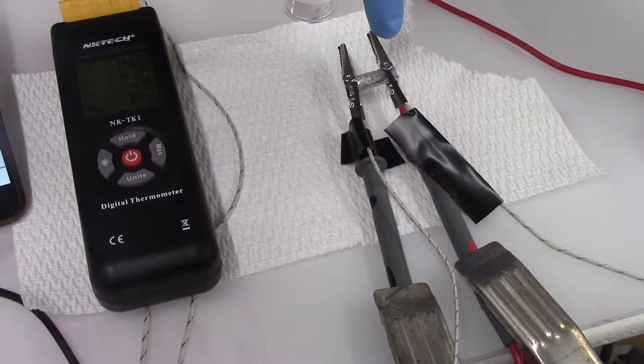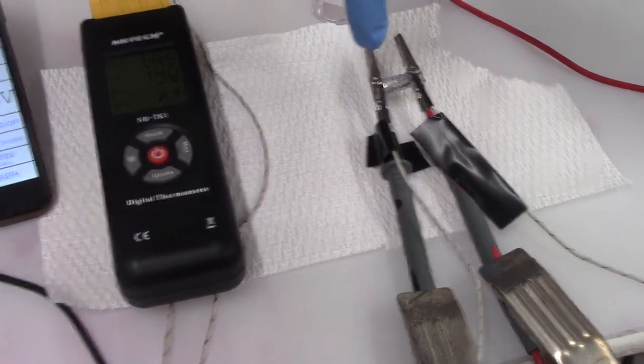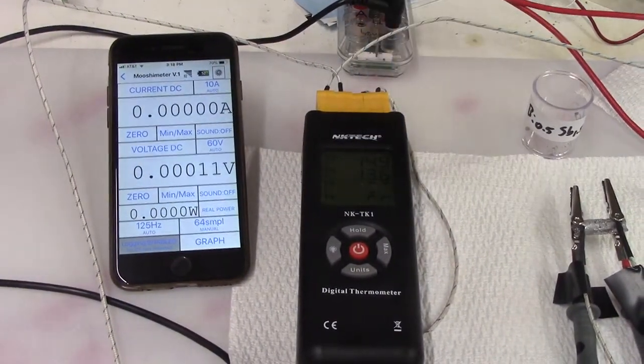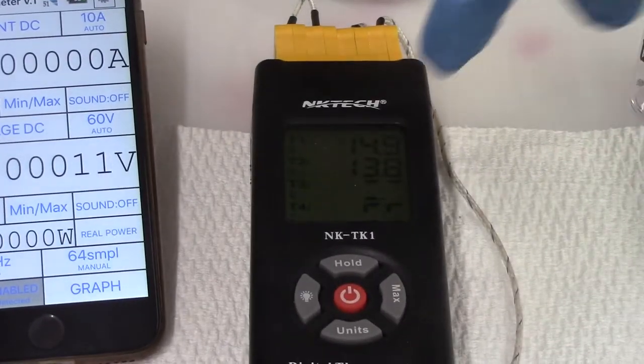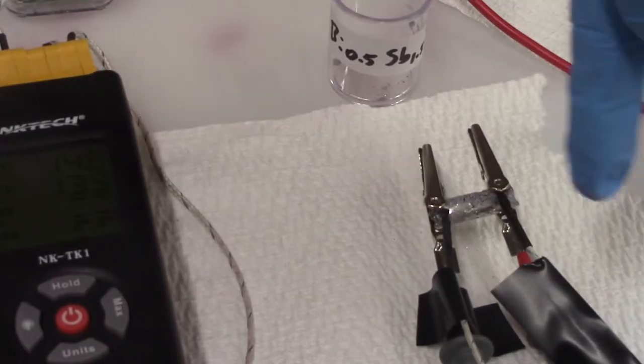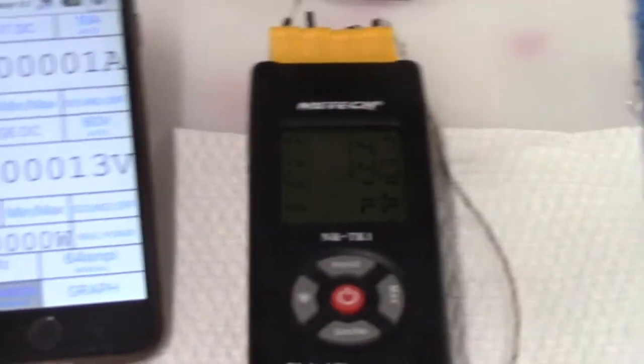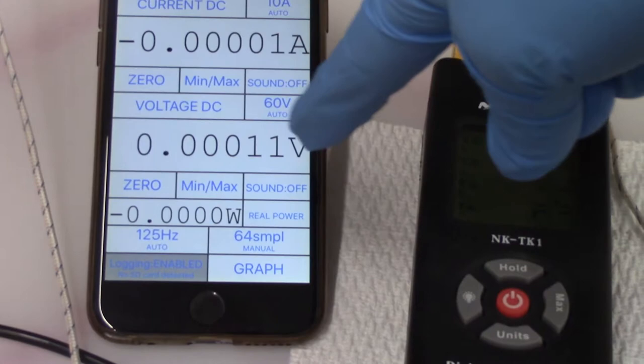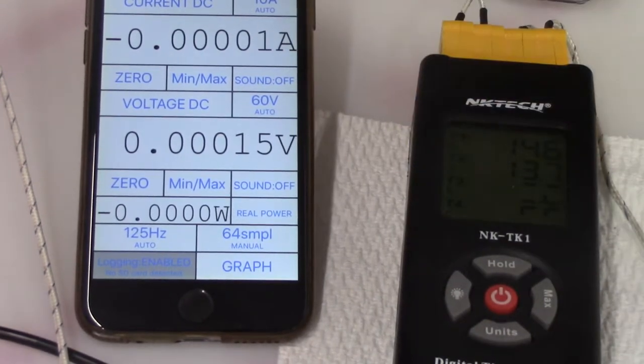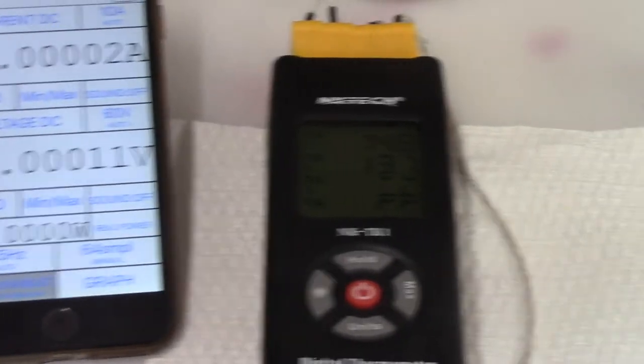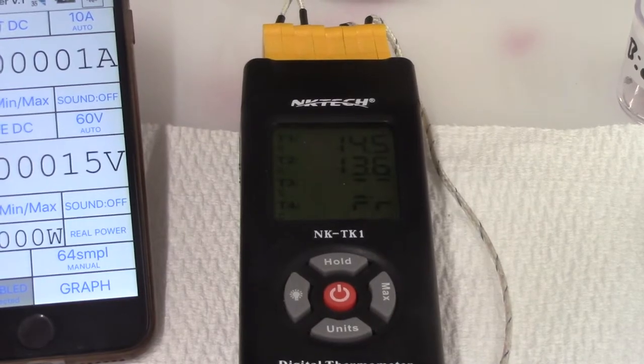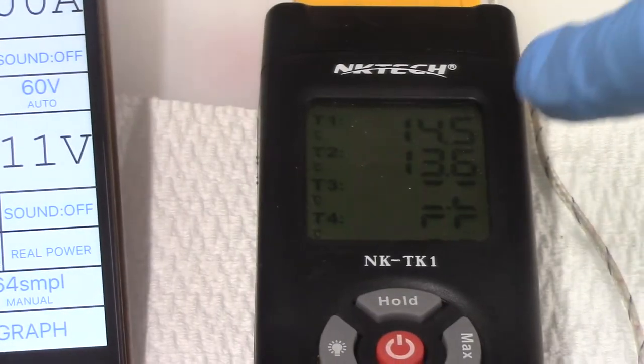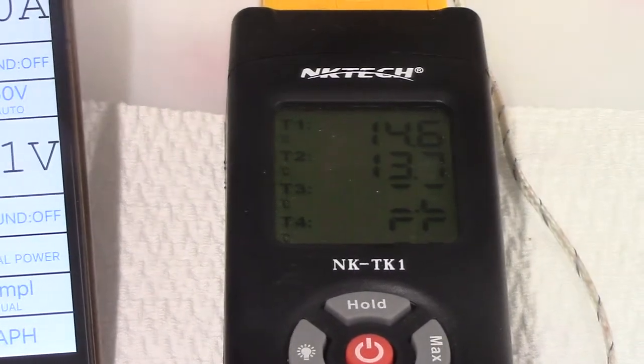The red side's going to the positive, black's going to the ground. This top temperature is this temperature over here. The second temperature is that temperature there. And then this is measuring the voltage. So right now it's measuring in the ten thousandths of a volt. So it's not measuring very much, but the temperature right now is very close. We're within about a degree Celsius of each other.